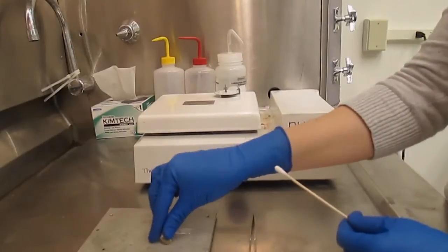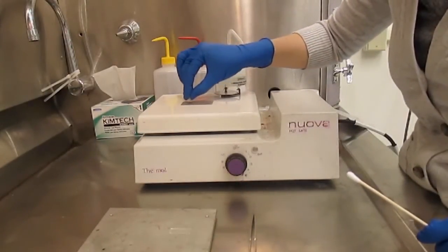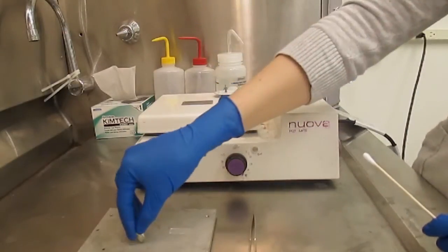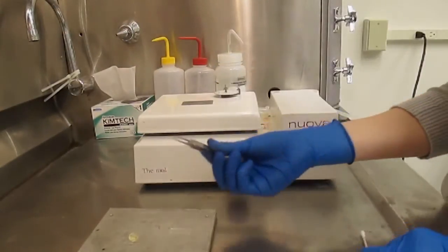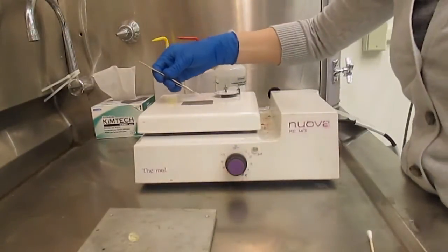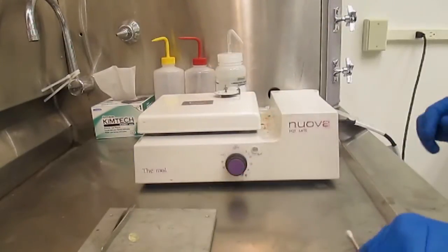Coat the middle of the specimen plate with enough crystal bond adhesive to accommodate the bulk glass. Use tweezers to place the bulk glass onto the melted crystal bond adhesive and gently press the glass down with a wooden stick until any air bubbles beneath the glass are expelled.